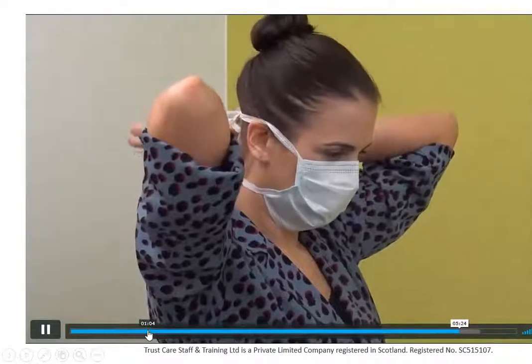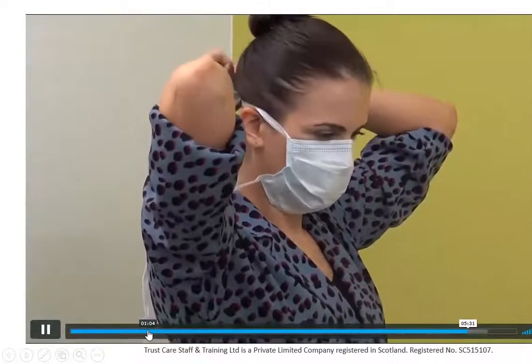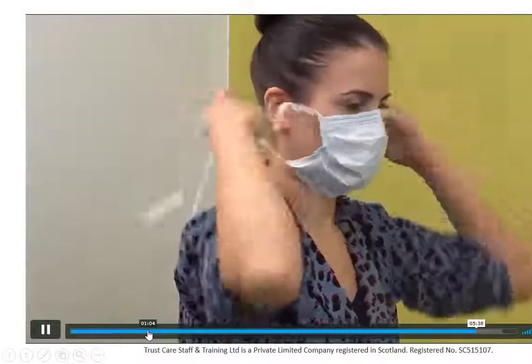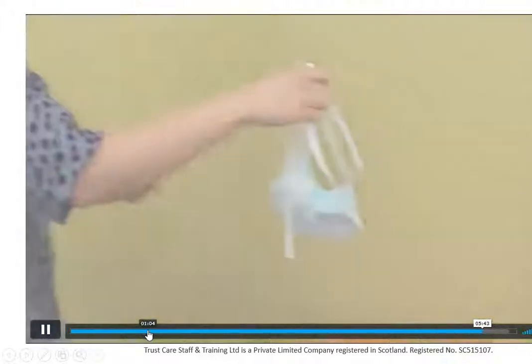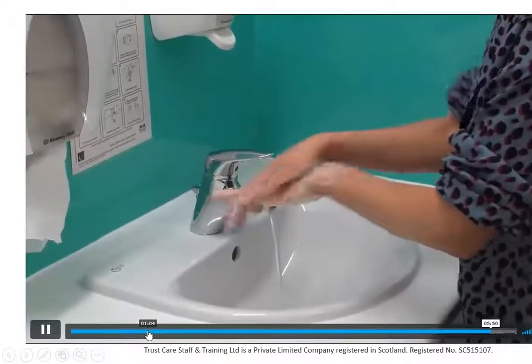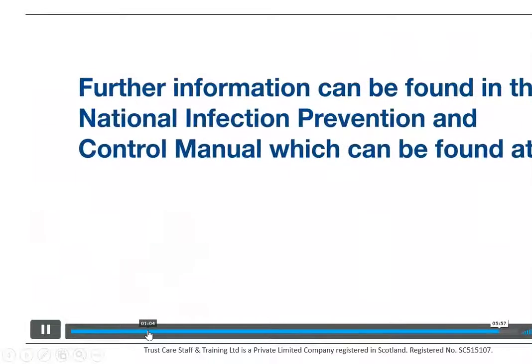The final thing you do is take off the face mask. Consider the front of the mask contaminated. Take the bottom tie off first, then take off the top ties and elastic. Lean forward slightly and only handle it by the ties, then discard. You should wash your hands for 20 seconds afterwards — you can use alcohol hand rub, but preferably soap and water if you can.